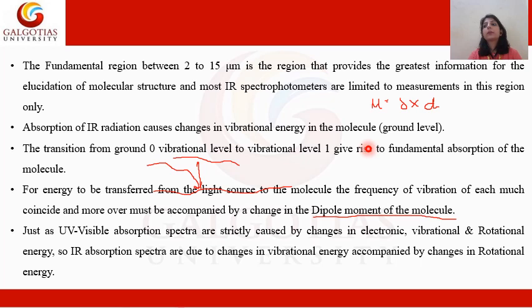Now whenever this change in dipole moment occurs, what will happen? This change in the dipole moment will generate an electric field around itself, and that electric field is having a certain frequency.